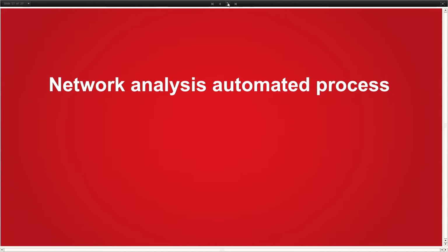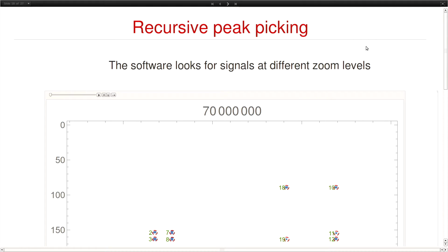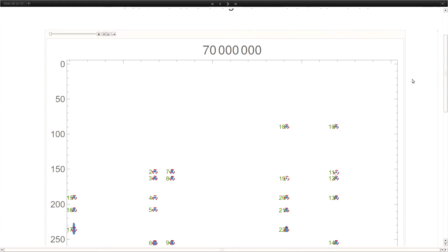All right, so here comes the mathematical part. So what's the idea of this? Again, we have this spectra that we collect from organic samples or whatever. And what we want to know is what's there. I mean, we get something from a plant or from an animal. I want to know what it's composed of. So there's the idea of using Mathematica to create a database and compare all our spectra and try to find out what's in here.